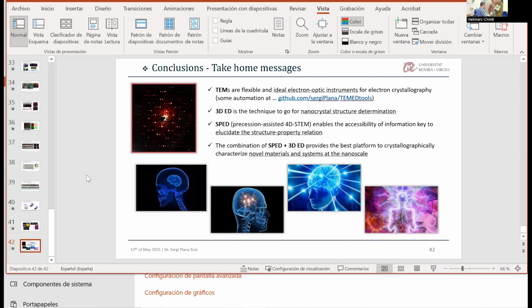Otherwise, you are not seeing the state that is, let's say, without saturation. You could. The problem is that usually magnetic domains are visualized through DPC. DPC and 4D STEM are different in the sense that DPC uses segmented detectors, not pixelated detectors, let's say. So you see the helicity?